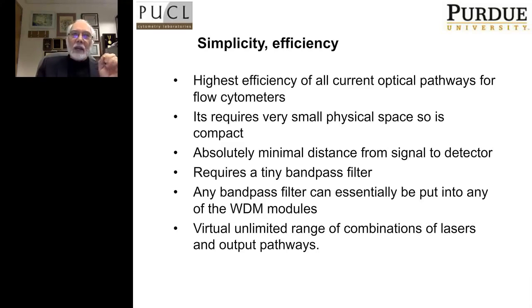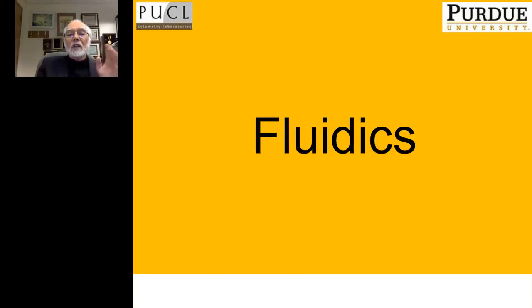And these bandpass filters are really, really very, very small. And the fact that you can stick any bandpass filter into any WDM module, I think, is pretty nice. There's virtually an unlimited number of combinations depending on which laser you select.